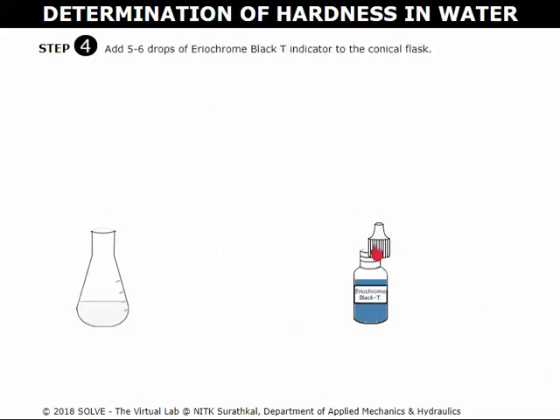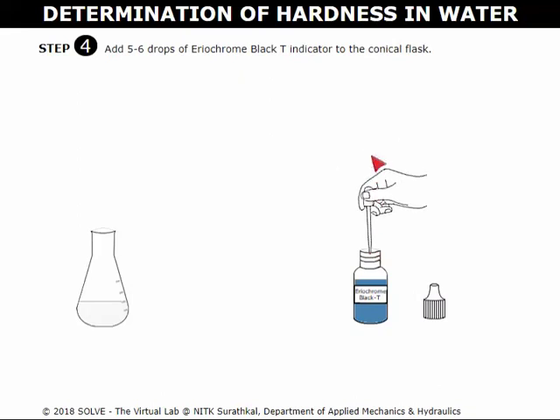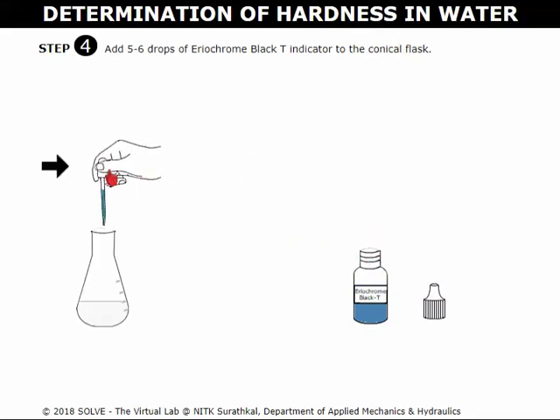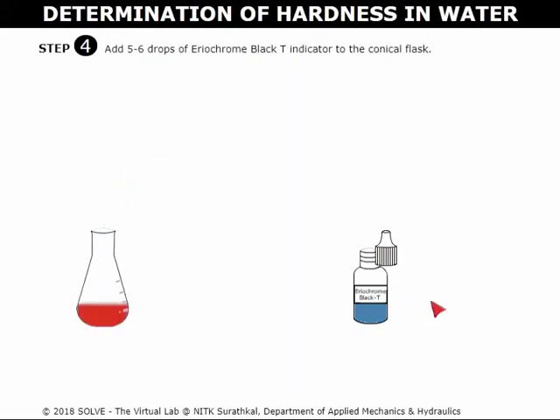Click here to open the lid of Eriochrome Black T indicator. Click on the dropper to collect the indicator. Click here to add five to six drops into the conical flask. Close the lid.